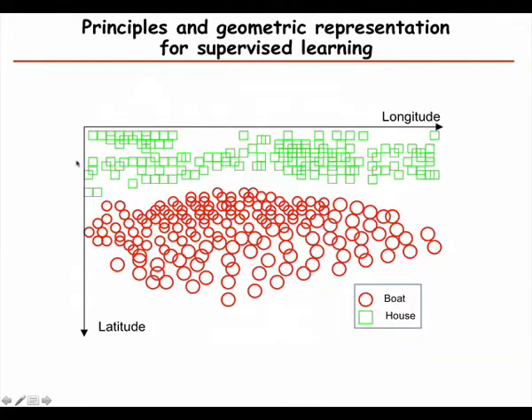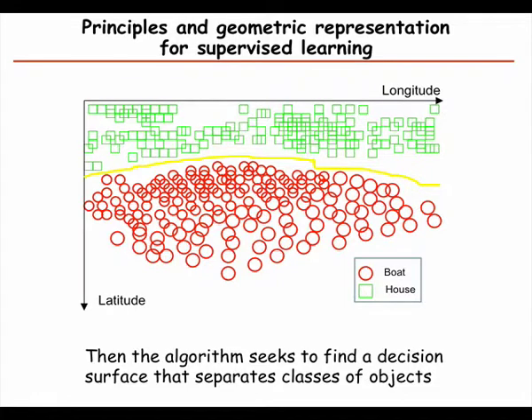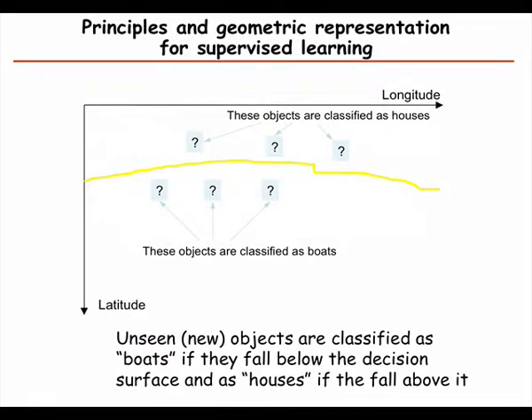and then, of course, we have two variables only here. So we have the longitude and latitude, and then we can do this classification. And remember, with high throughput assays, we don't just have two variables, we have thousands or tens of thousands of variables. So with this, we find an algorithm that best separates these two classes. And then when we look at an unknown object, then we can classify unknown objects.